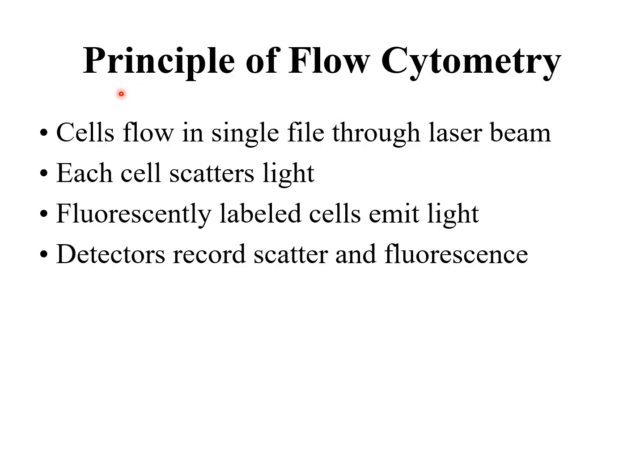So, coming to the principle, it is based on the principle that cells flow in a single file through a laser beam. Each cell scatters light, and if fluorescently labeled, cells emit light, and this scattered light and emitted light is detected by the detector.